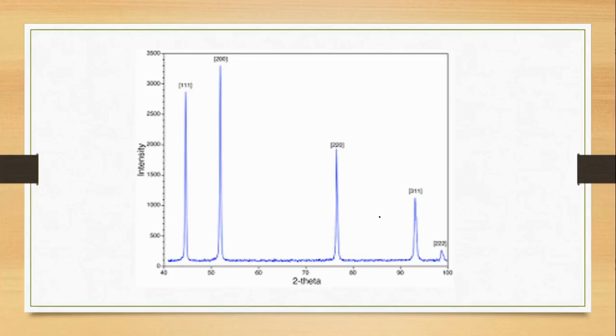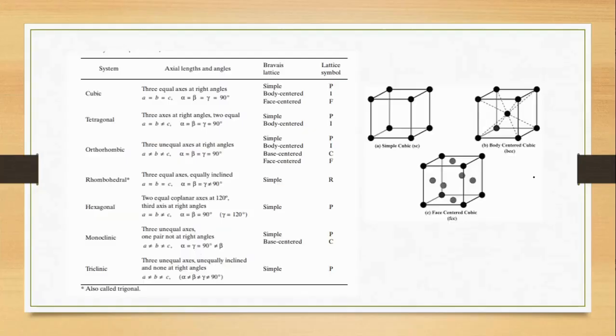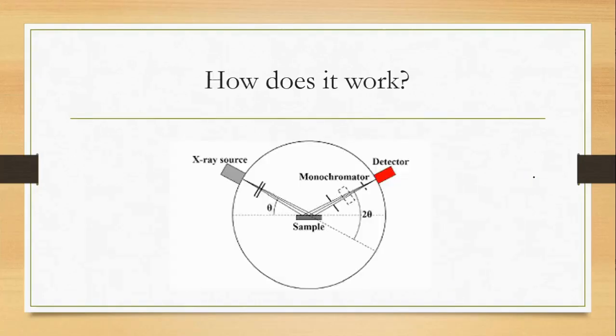Okay, so this is a standard plot of XRD. What we see here is 2 theta, and what we see is intensity. 2 theta, like I've explained before, is a result of taking account of the incident beam and the diffracted beam. That's why there's a 2, right? If you see that diagram, I have to keep scrolling back. See, it's taking account of this part here.